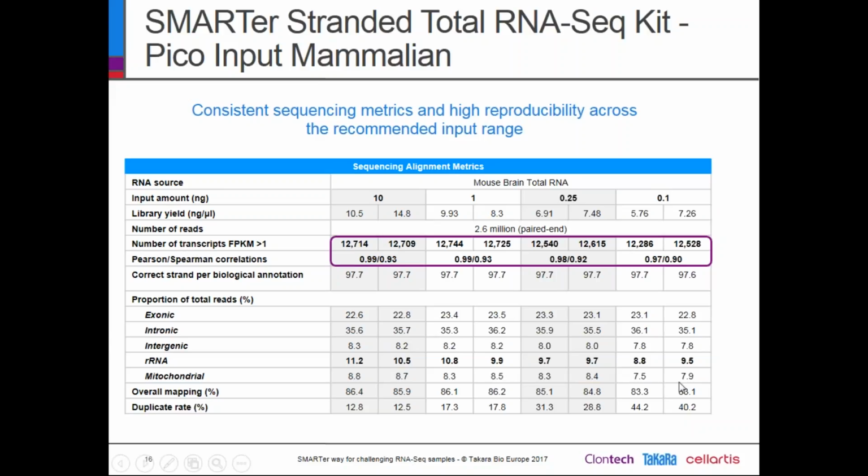Here you will see that we are rather around 10% of ribosomal RNA. So this means that the technology that we use here to deplete ribosomal cDNA is less efficient than the technology used in RiboGone. But still, this 10% is much better than the 90% that we would find if we don't do any treatment.